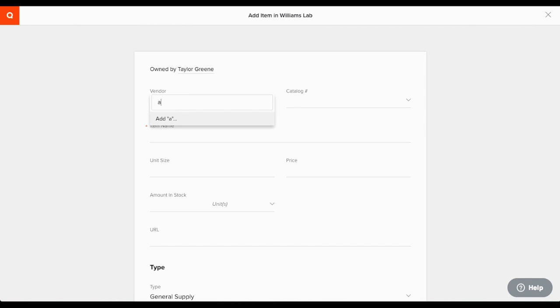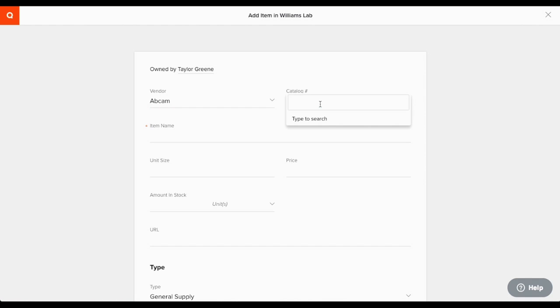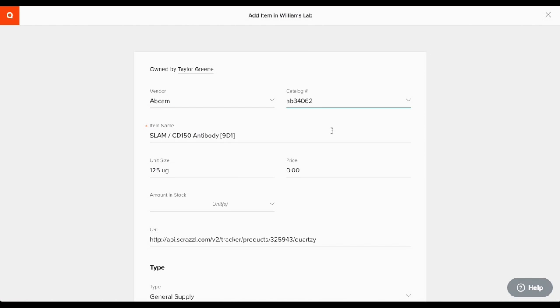Type the name of the vendor who supplied the item. If we host the vendor's catalog, some fields on the form will autocomplete for you. If options don't show when typing a catalog number, just enter the information you have.